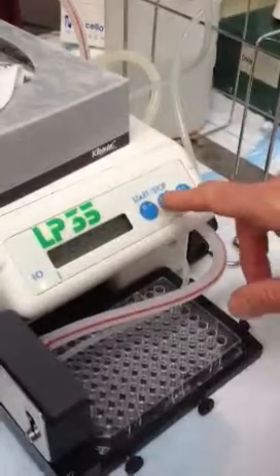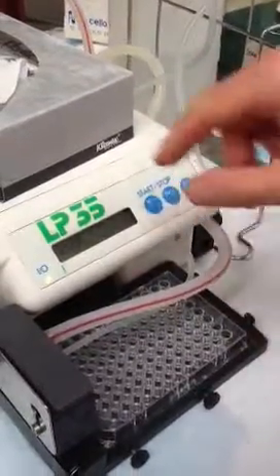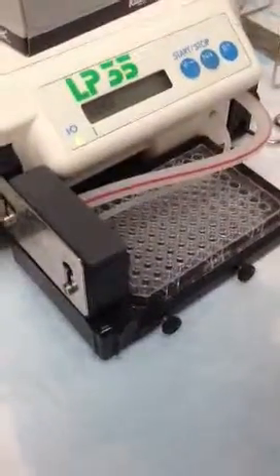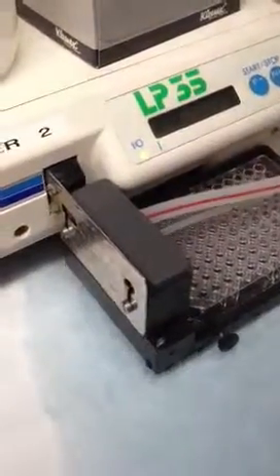Once you go through, you've got to go through until you stop. So I'm going to rinse and it should suck. It needs to be all sealed up. If it's not sealed up, it won't work.